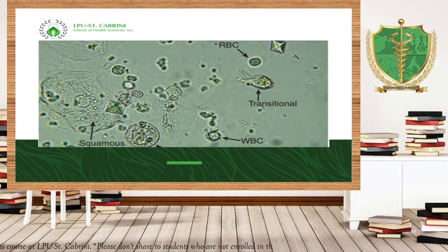Okay, so we have here your squamous epithelial cells, like what I've said, the largest cells that can be seen in the urine.